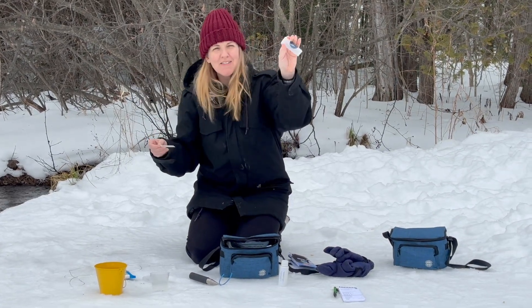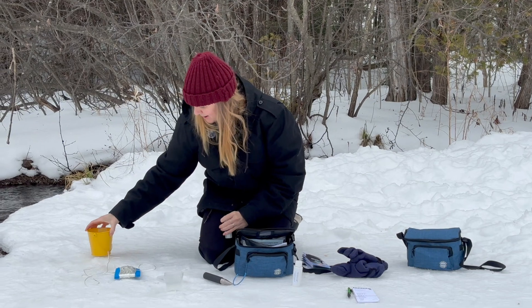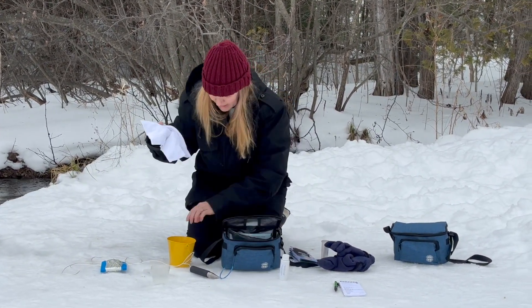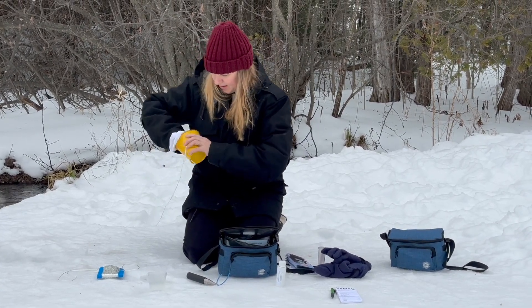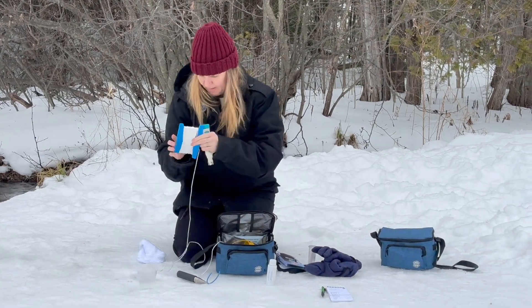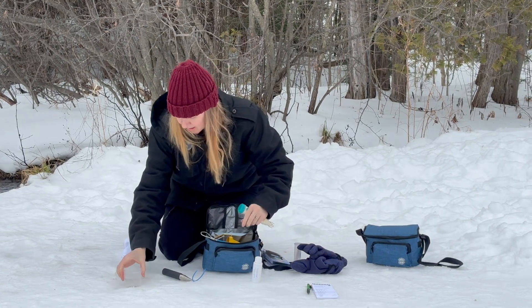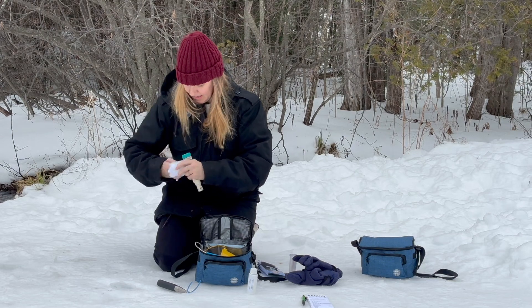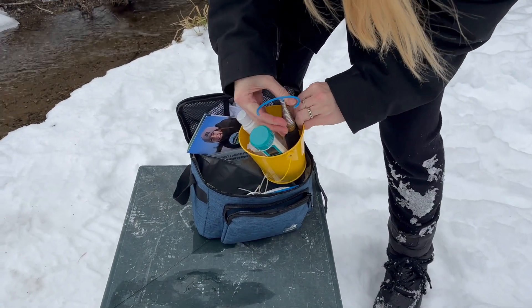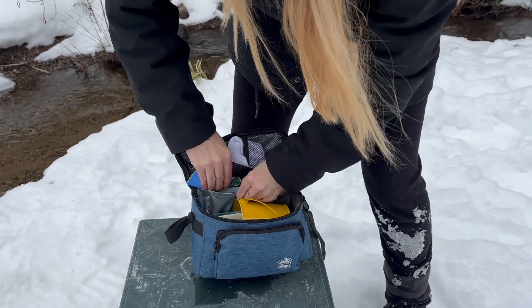When you're done with your strip, we have a little container that you can use and then dispose of when you get home. Now I'm going to pack up my kit. First step is to empty out your water containers, dry off your bucket, and place it sideways in the bag. Your items go into the bucket. Don't forget your comparison guide, your notepad, and your pen — those go into the little back pocket.